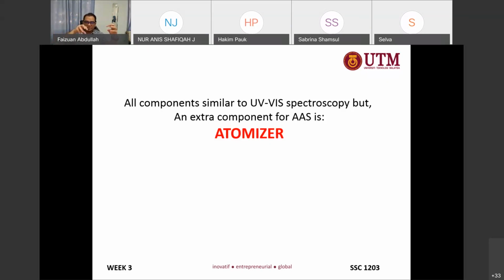If there are iron atoms in the sample that absorb the energy we have provided here, and the electron becomes excited from ground state to excited state, the detector will detect a decreasing amount, because the energy that was provided will decrease. The detector will detect some loss of energy. So it means that in the sample we have iron.